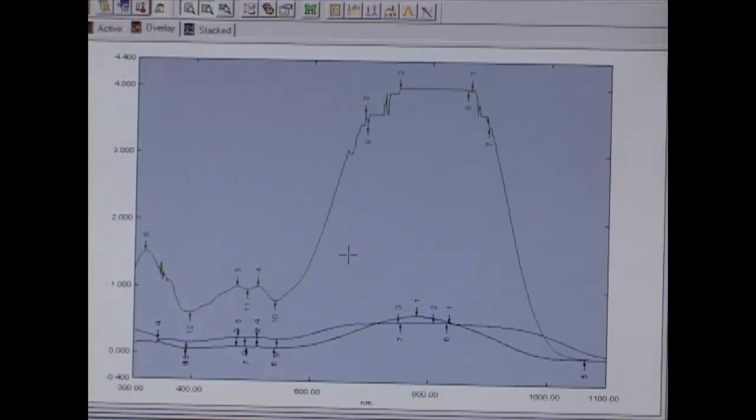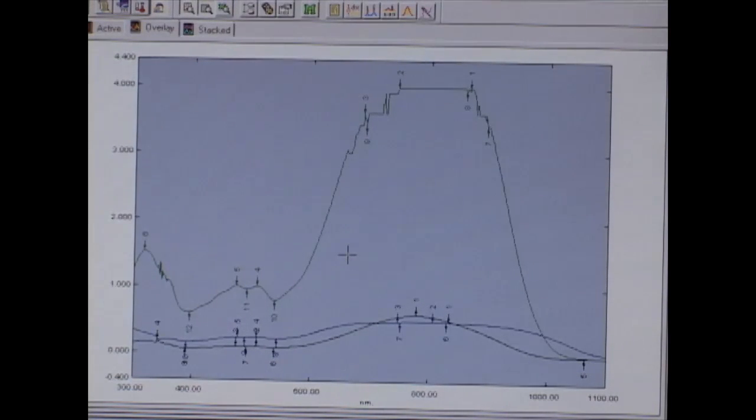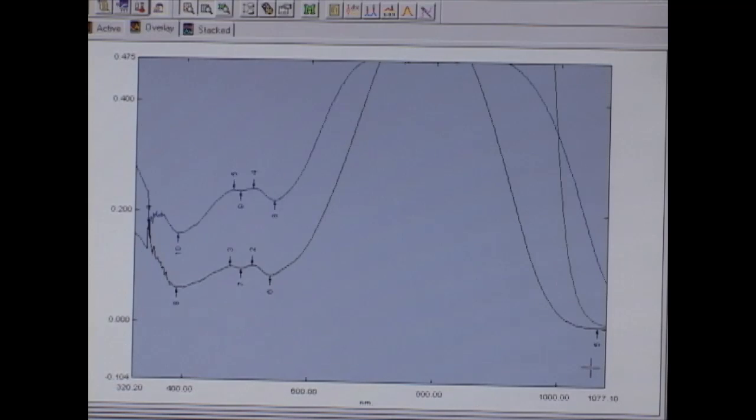Now if we want to zoom on particular area of the spectrum, we can left click and drag. If you want to zoom out, you just need to do double click.